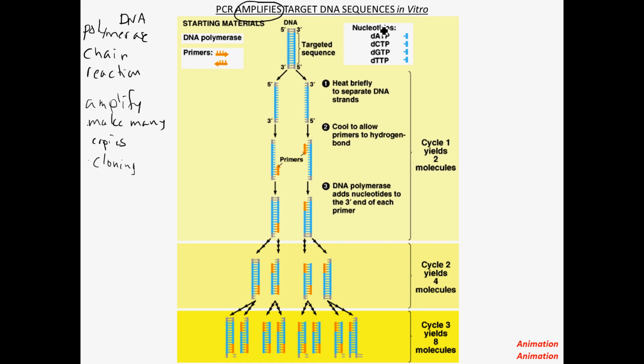Now, where is this happening? This is happening in vitro, meaning in glass. That is not in a cell, but instead of glass, we're going to be using little teeny tiny plastic microcentrifuge tubes. So, in glass, plastic, whatever, same difference.